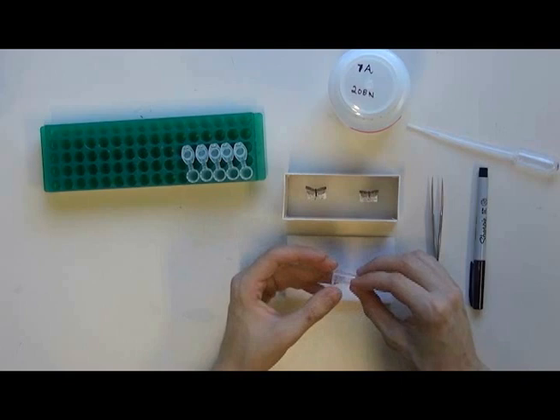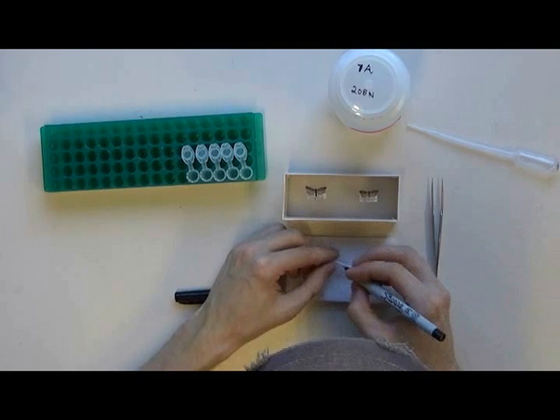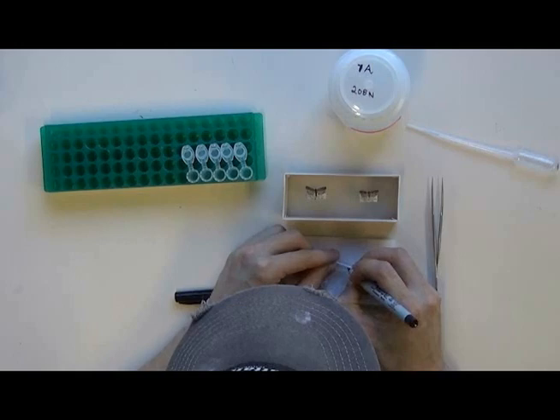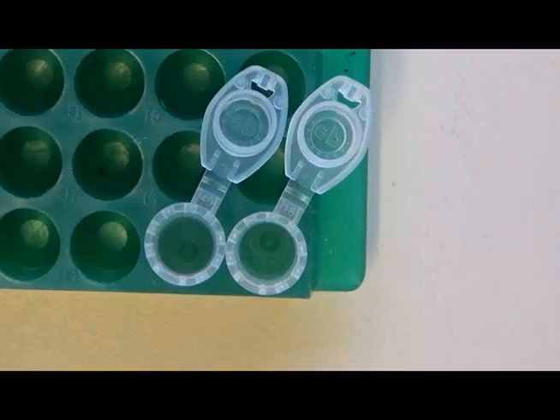Before I do anything, I need to label my dissections. With a fine Sharpie, I write a number on a small Eppendorf tube, which will help me associate my dissection with the moth it came from throughout the dissection process. I will then fill the tube with a 20% solution of KOH, also known as potassium hydroxide.